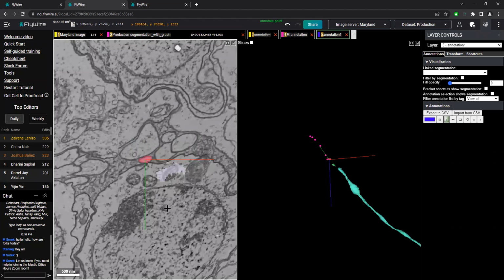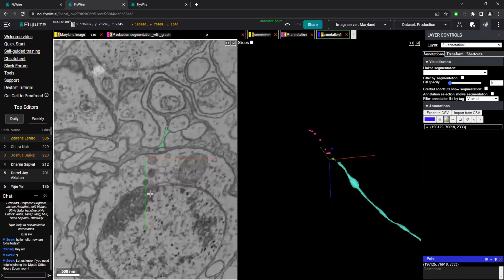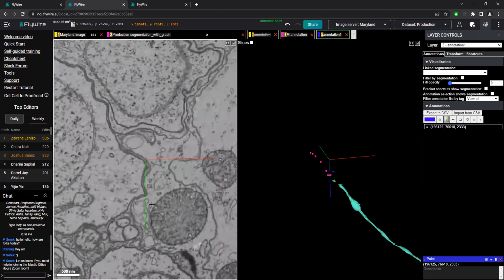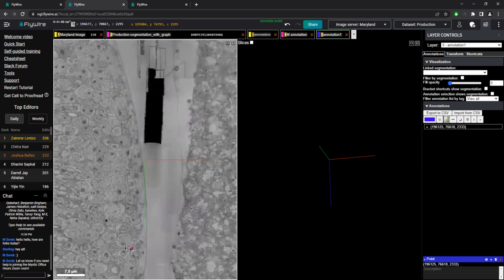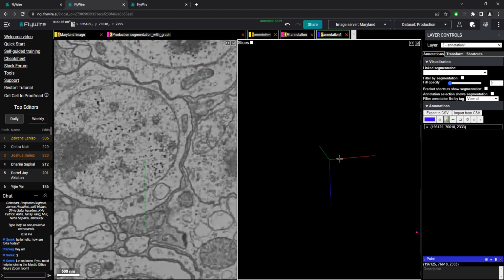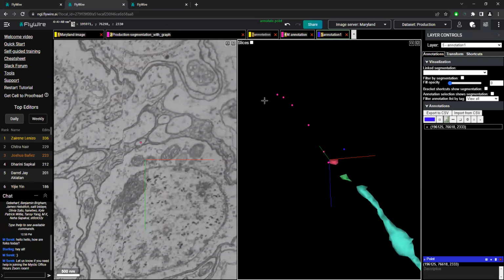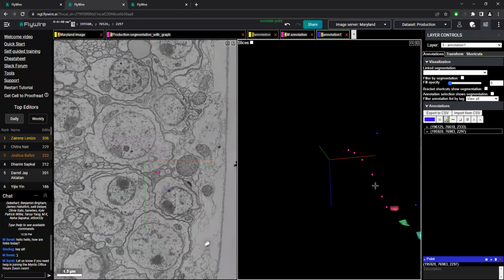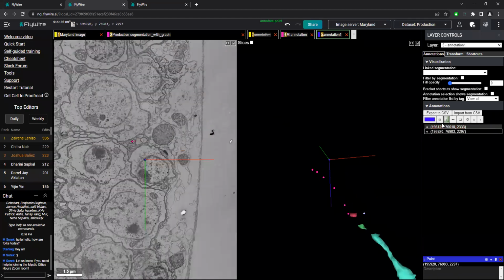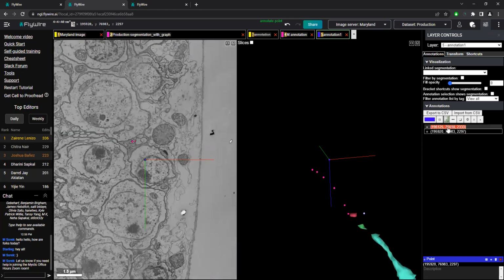Let's say we're following just this big giant cell body instead. So we'll scroll up until we think we're kind of in the safe area and go, oh, okay. Whoops. Scrolled out too much. All right, bring me back, please. Where are we? There we are. Say we know that we want to follow this large cell body at the bottom here. And so we could place 2 points and jump between the two of them. And that would allow us to maybe use that as the landmark that we jump in between on our slides in order to find the continuation.